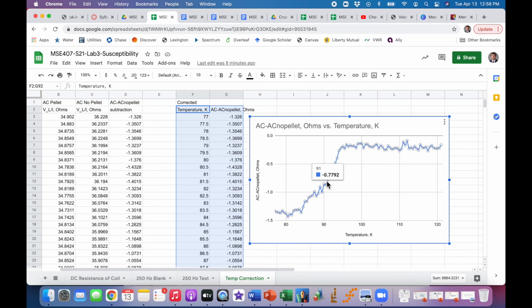All right, so that tells us the critical temperature for our superconductor. We have an onset up here at around 94 or 94.5, one of those values, and then the slope stops changing around this value here. If you fit this line, then this point right here at about 84 is about where it stops changing slope.